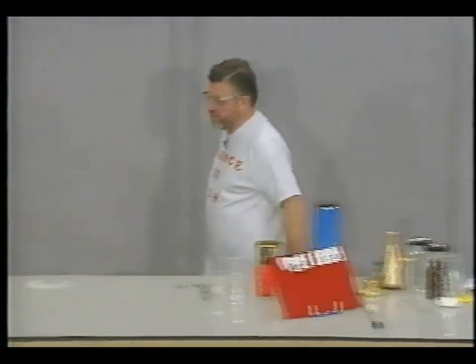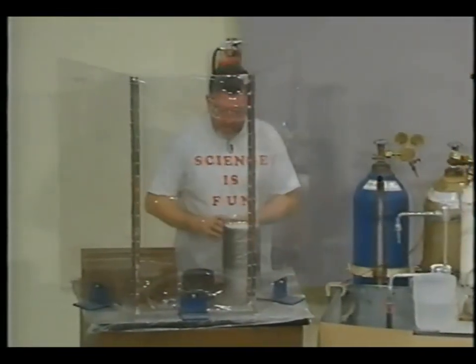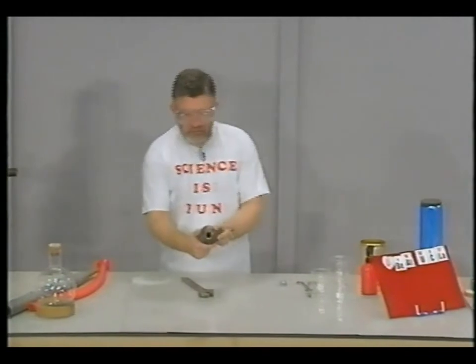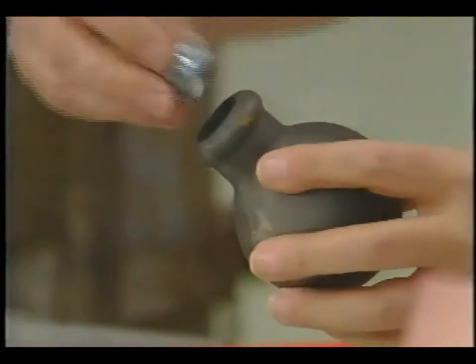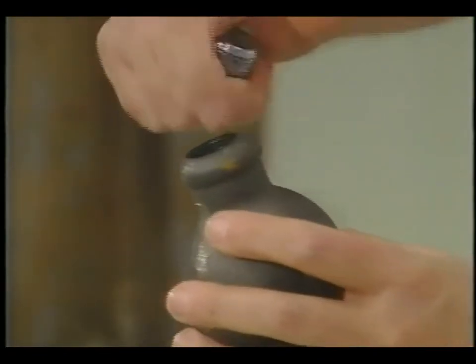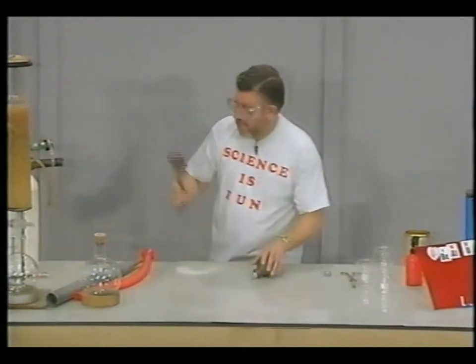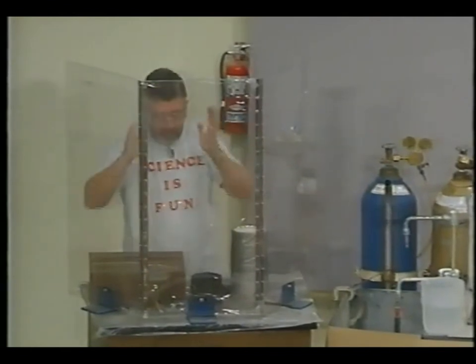Let's look at another experiment that we're going to do at this end of the lab bench. This experiment we're going to do actually with this ball, which is a cast iron ball that has a screw top on it, which screws like this. But what I'm going to do is put some water in here. Okay? I'll put some water in here and do the experiment over at this end of the bench where I have a safety protection shield.